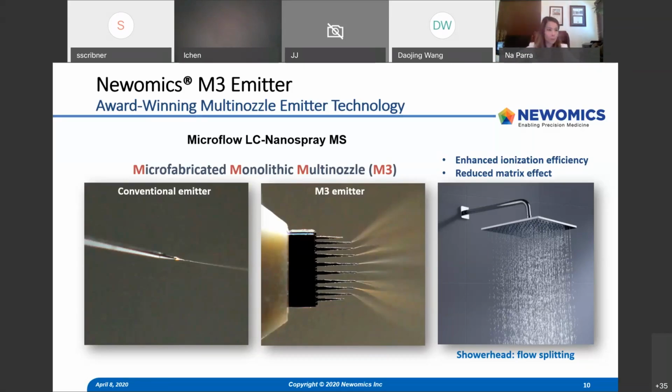For native spray, which is the focus today, we have demonstrated that we can run 150 runs. Those are LC-MS runs of 15 to 20 minutes each. So essentially, it's a 3-day experiment. This is very reproducible, and also it is very hard to do. If you imagine the aqueous phase with high salts, we can still run 150 runs.